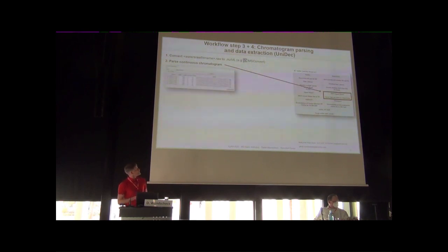Within the import wizard, it's probably a bit small, you then load your raw file, and I'm using the scans option, where you then slice your raw file. In this case, every 5 scans become one single mass spectrum. Then you hit the load all to HDF file button, and this HDF5 file can then be loaded in MetaUniDec, shown here at the top.